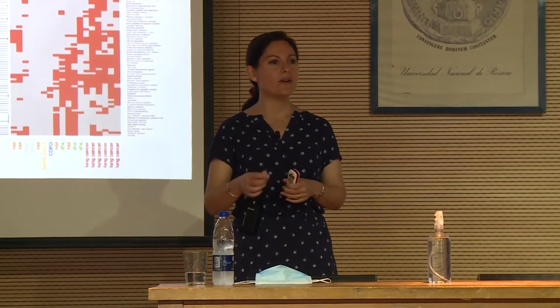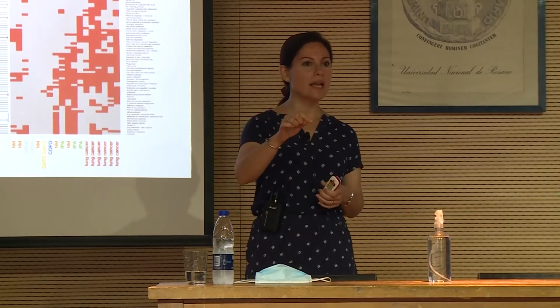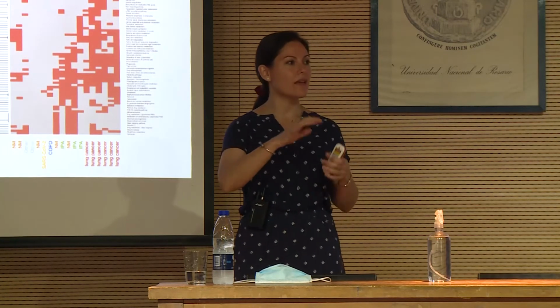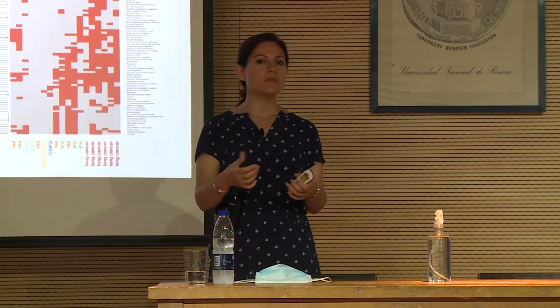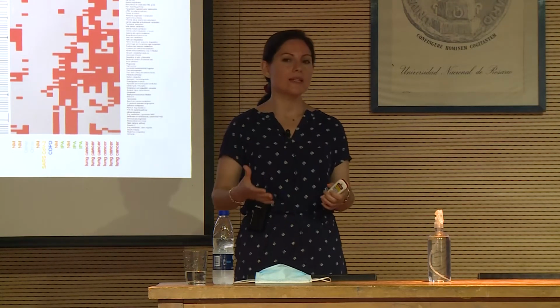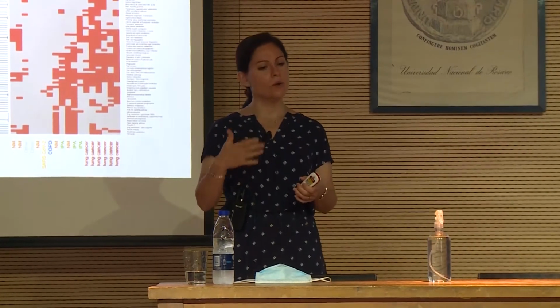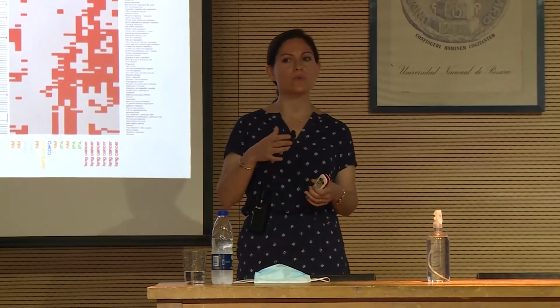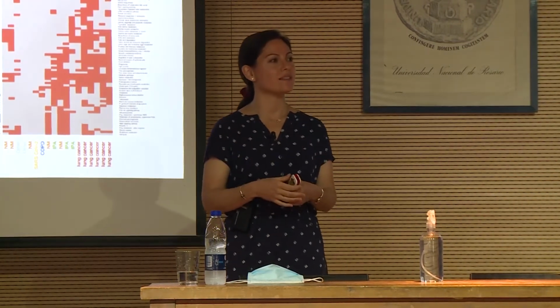But then you have to do it manually, and you have to sort the outliers manually, and everything. It needs your constant input, and that's why we decided it's not going to work like this. We need something standardized. We want to go further from the bias that we can bring to the analysis.